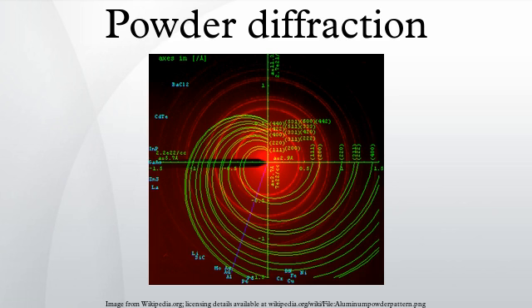Diffractometers. Diffractometers can be operated both in transmission and in reflection configurations. The reflection one is more common. The powder sample is filled in a small disc-like container and its surface carefully flattened. The disc is put on one axis of the diffractometer and tilted by an angle θ while a detector rotates around it on an arm at twice this angle. This configuration is known under the name Bragg-Brentano θ-2θ.